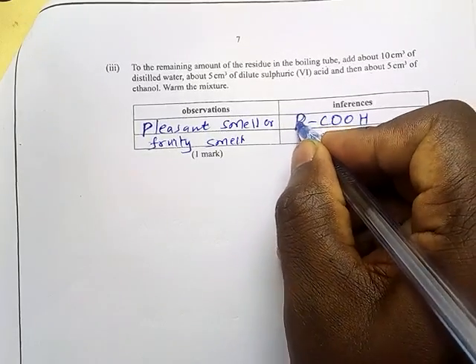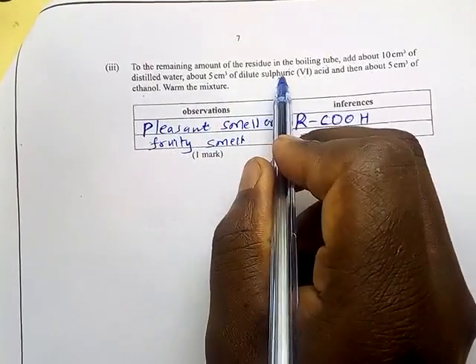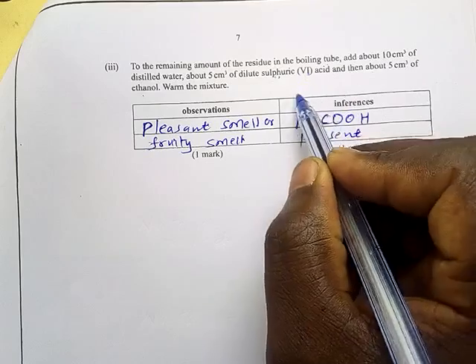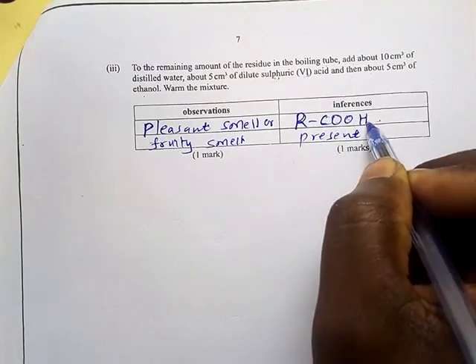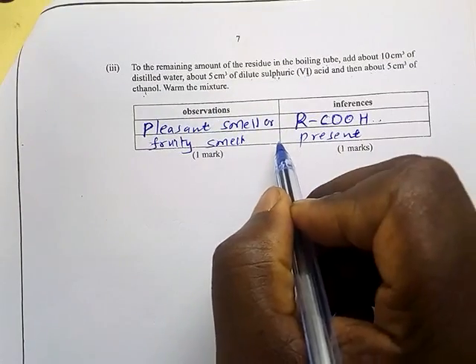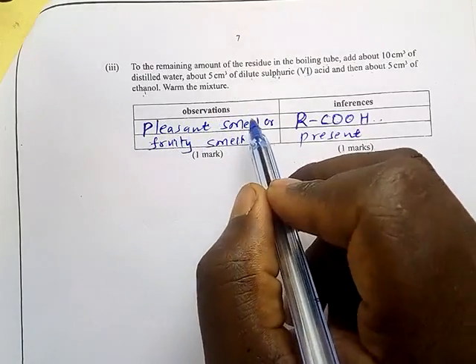Why are we saying that this alkanoic acid is present? Because we know an alkanoic acid plus ethanol in the presence of dilute sulfuric acid forms an ester. Esterification. Esters are very pleasant smelling organic compounds. Therefore, we say that the alkanoic acid is present because alkanoic acid plus ethanol plus this, and then you warm, you form an ester. Ester formation is called esterification, and the compound formed is very pleasant smelling.